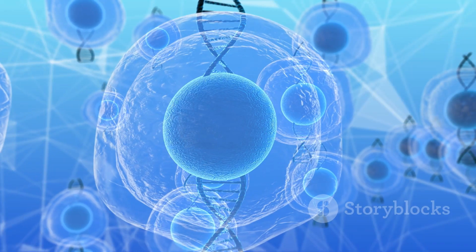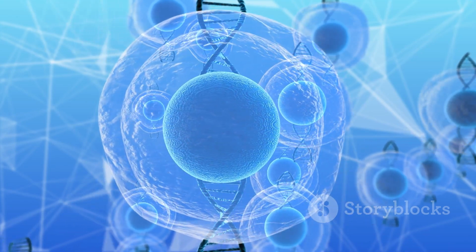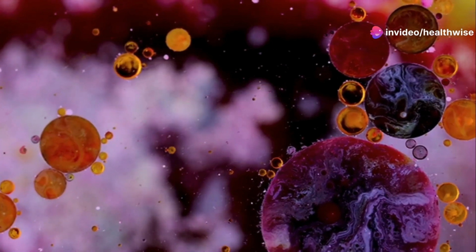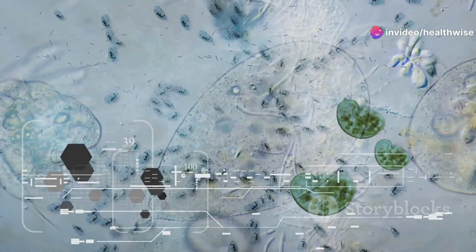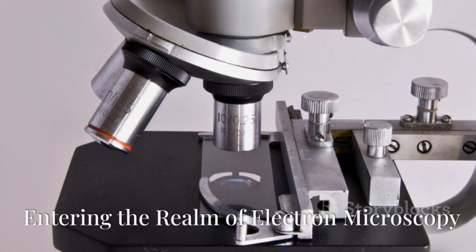We can see organelles, nuclei, and even the delicate dance of cell division in real time. The phase contrast microscope was a game-changer for cell biology. It allowed scientists to study living cells in their natural state, opening up a whole new world of understanding about life's fundamental unit.